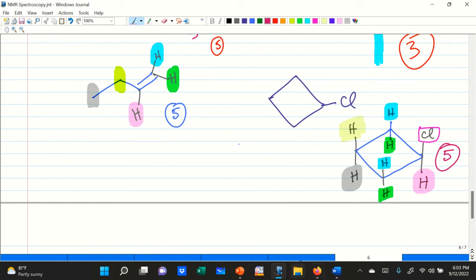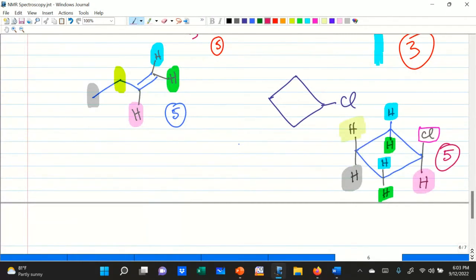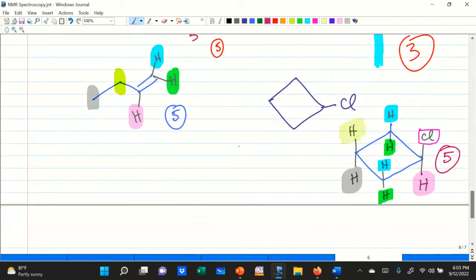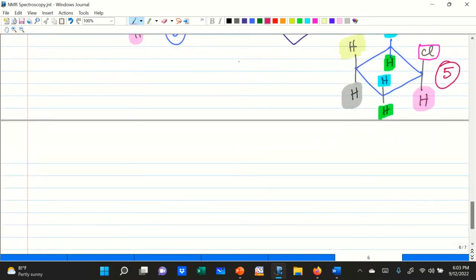So that is every time you have a ring, and I have shown you with one example. You should work with other ring systems, 3, 4, 5. You should also try having an additional group other than one chlorine. If you have a methyl group or additional chlorine, that can be cis or trans, and work them out. This is an advanced class. I will definitely challenge you in those multiple ways, creating some extra thinking necessary. This is not a freshman biology class. This is an advanced level chemistry class. So you have to be challenging yourself as I am and be prepared accordingly.